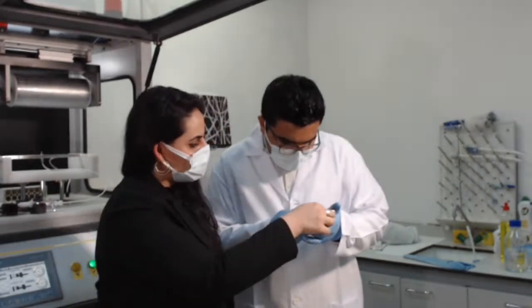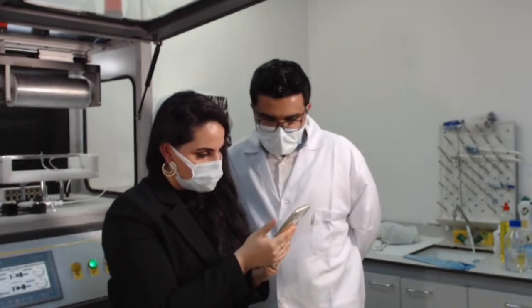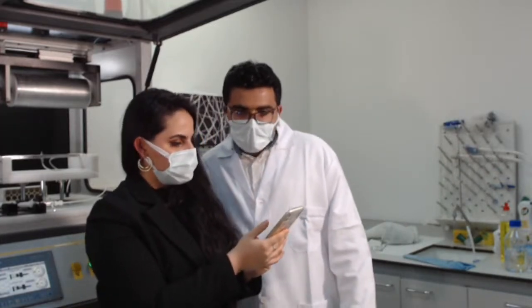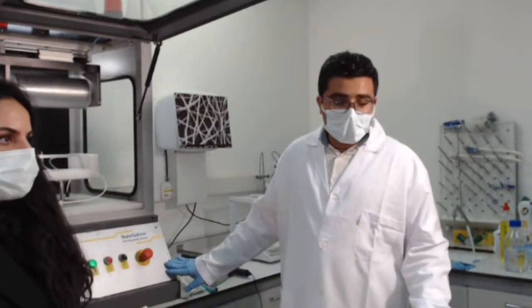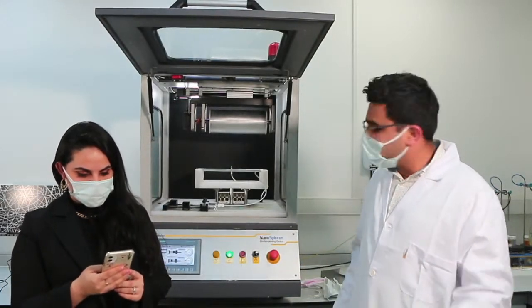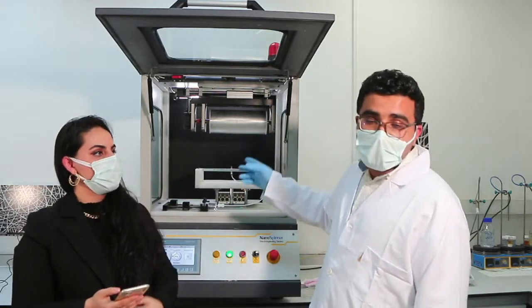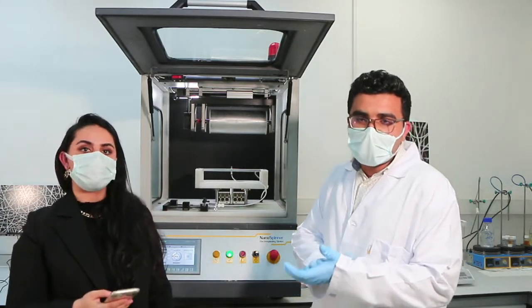Let's see what we have. Okay. Do you know the max current that the tool can supply? Okay, so for the NS24, it's about 40 kilovolts max, and it operates with low current, about 0.125 milliampere. You can actually see it in the machine. While the process is going, it'll show you how much current is flowing into the system while electrospinning happens. So yes, it's very small, 0.125 milliampere.